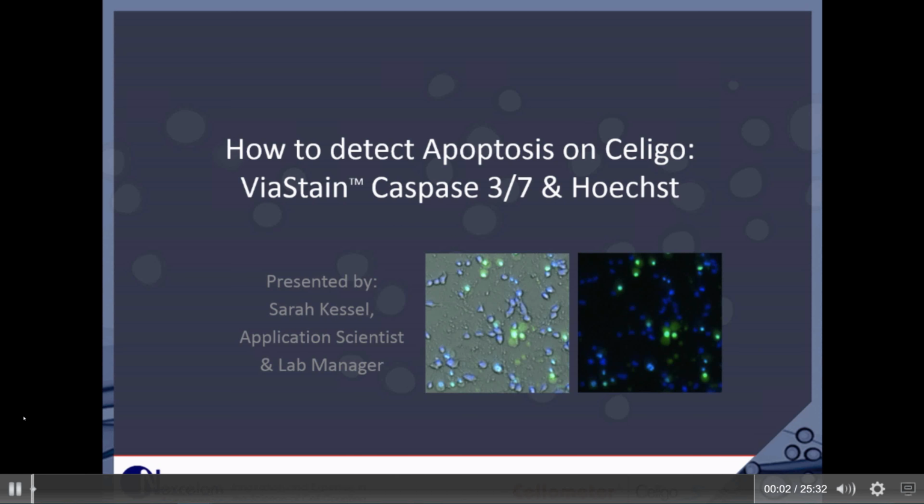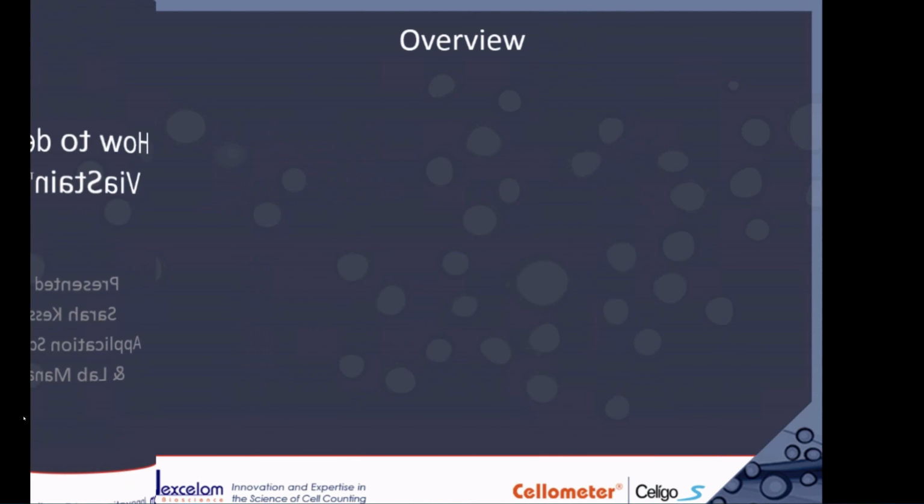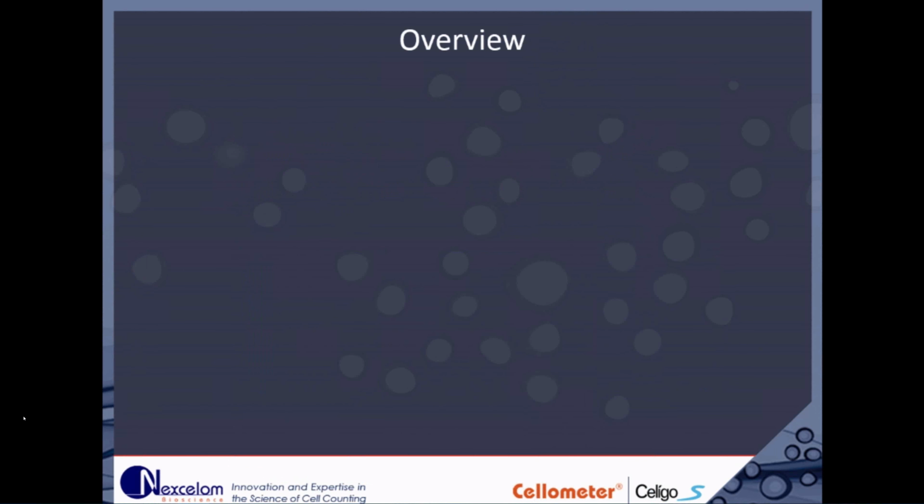Training webinar for Celigo. As she mentioned, we're going to talk about the Caspase and Hoechst assay on Celigo. This is a really easy assay, and it's what I would call a clean assay, not too difficult. And that helps that we're going to use Hoechst to identify our cells. Even though the cells are looking kind of sickly with the drug treatment, you can see in this bright field image, the idea is to identify the cells that have the green stain. So we use Hoechst as our marker.